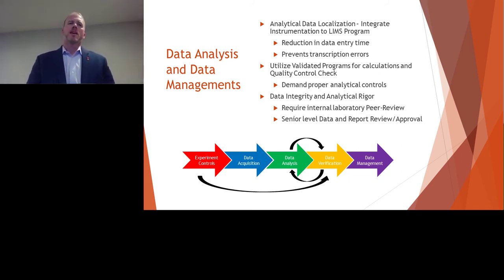But a big thing in your data analysis is making sure that your experimental controls and your data verification steps are built in. Your experimental controls are checking that your instrument is running the way it's supposed to and falls within that validation package that you established, so that the instrument's running properly and that you have a complete extraction. The actual extraction techniques fall within the purview of this particular sample, and you can trust the data that you are producing.